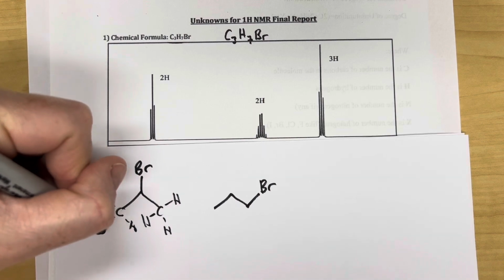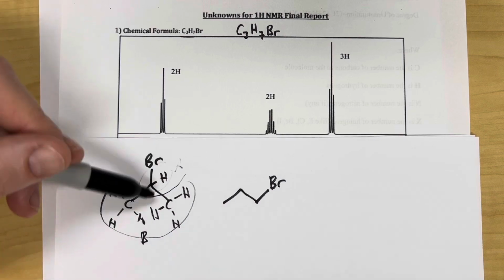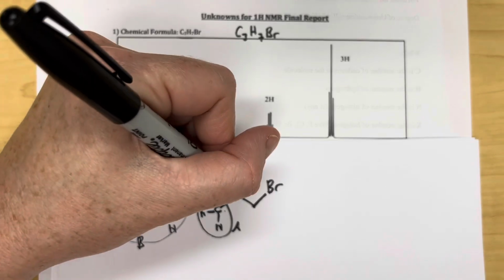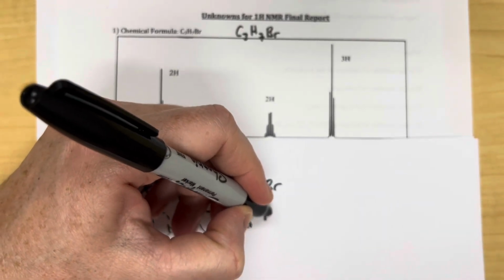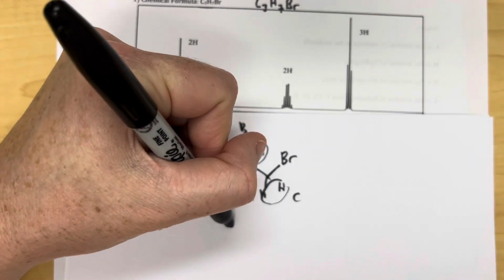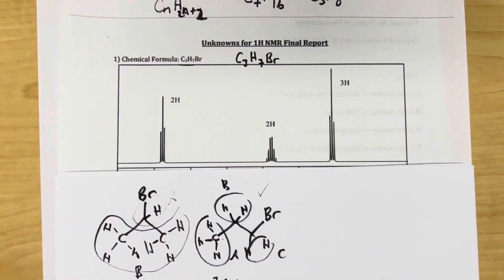These would all be exactly the same. And there's another little hydrogen right here. So this would be like group A, and these would be group B. And so this would only give off 2 signals, as opposed to this structure, where we have this, which we'll call A. We have these 2, which we'll call B. And we even have these 2, which we'll call C. All right, so this has 3 signals. This one only had 2. This has 3. Because this NMR has 3, I already know it's this one. But let's go through and double check and see if we can figure out why, because that's way more fun than actually just deducing.